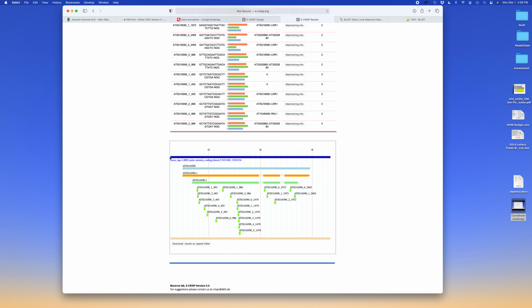So this is 0. Our numbers start at 1 right here, on the full-length cDNA, and then we have another coordinate starting here at 1, so we have three different coordinate systems, and they have yet another coordinate system. To make it a little simpler and not have to do a whole bunch of problem solving, what we're going to do is use BLAST.